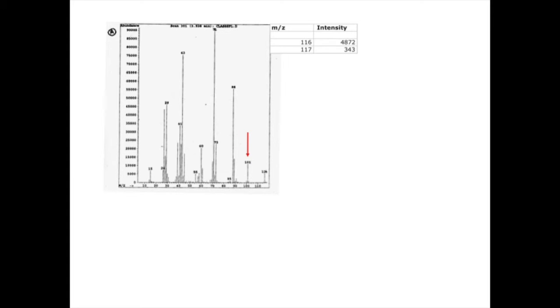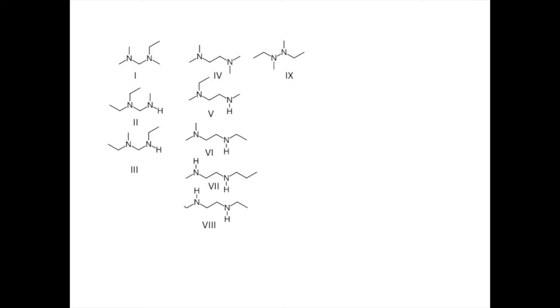Let's start at the high mass end of the spectrum. Prominent peaks at the high mass end are very important and can be easier to explain with simple fragmentation pathways than at the low masses. For example, this peak at 101 is 15 mass units smaller than the molecular ion. It almost certainly represents the loss of a methyl radical. So, which of these molecules will lose a neutral methyl group easily? Let's consider the first structure. If we ionize the nitrogen atom on the right, then the radical will try to form a new bond with an adjacent atom, and we break off a neutral methyl radical. Notice that we needed to have an ethyl group attached to the nitrogen for this to work out. Structure 4 does not meet this criterion, so we can roll it out.